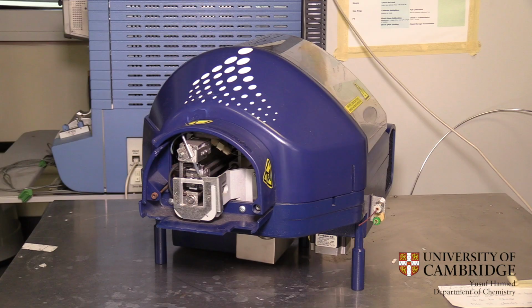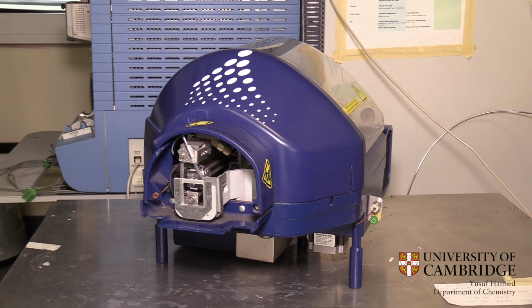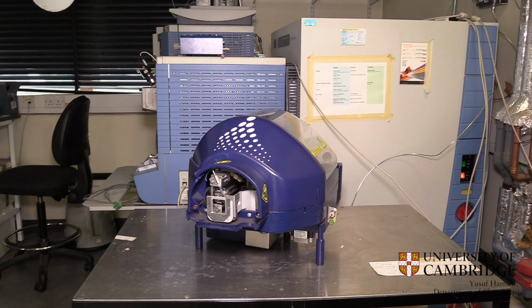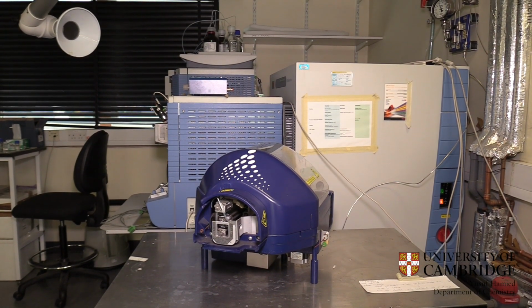Here you see a nanoelectrospray. This instrument is used in combination with the high-resolution mass spectrometer that is behind it. And we use it for liquid extraction surface analysis. So with this particular device, combined to the instruments that you see behind it, we can do spatially resolved chemical characterization of various types of samples. For example, we have used this instrument to do a spatially resolved chemical characterization of petals of flowers.